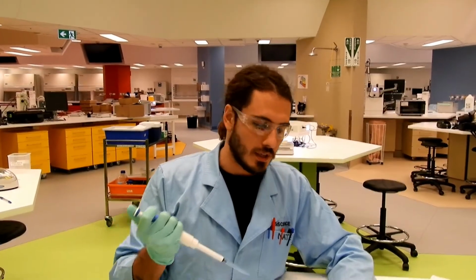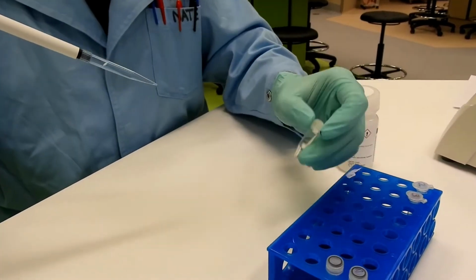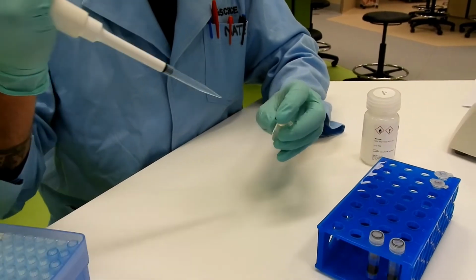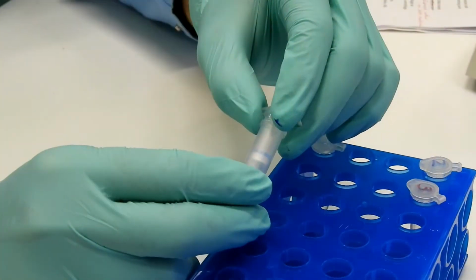Next, we retain our DNA by binding it to a silicon filter. To do this, we'll add 1 ml of a high salt concentration reagent and then vortex. At high salt concentrations, DNA binds tightly to silica, and this will help us to remove other non-DNA materials.